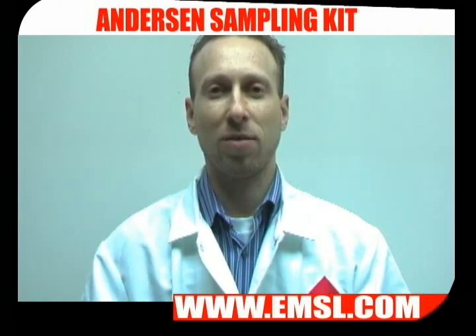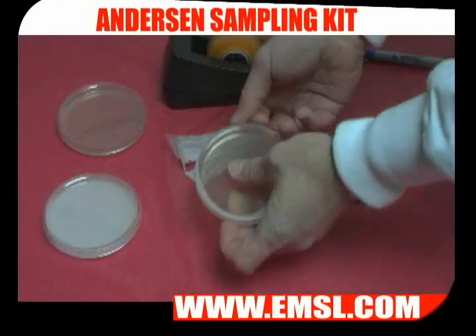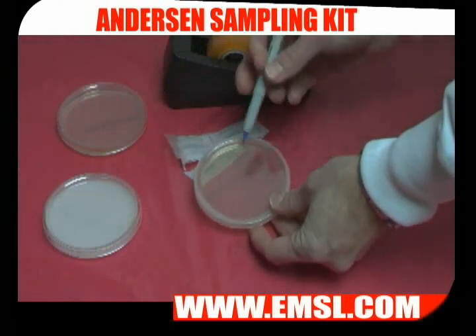Sample for two to five minutes. Once you're done sampling, seal up the plate using parafilm wax. If you don't have parafilm, simply use scotch tape. Label it and get it ready for shipping.